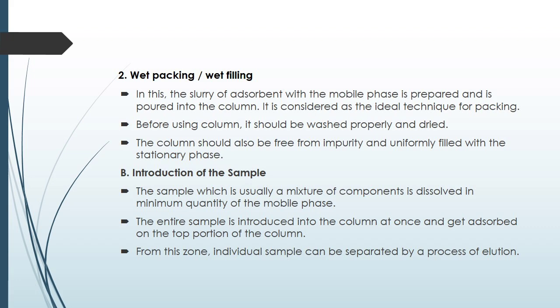Introduction of sample. The sample, usually a mixture of components, is dissolved in a minimum quantity of the mobile phase. The entire sample is introduced into the column at once and gets adsorbed on the top portion of the column. From this zone, individual components can be separated by a process of elution.